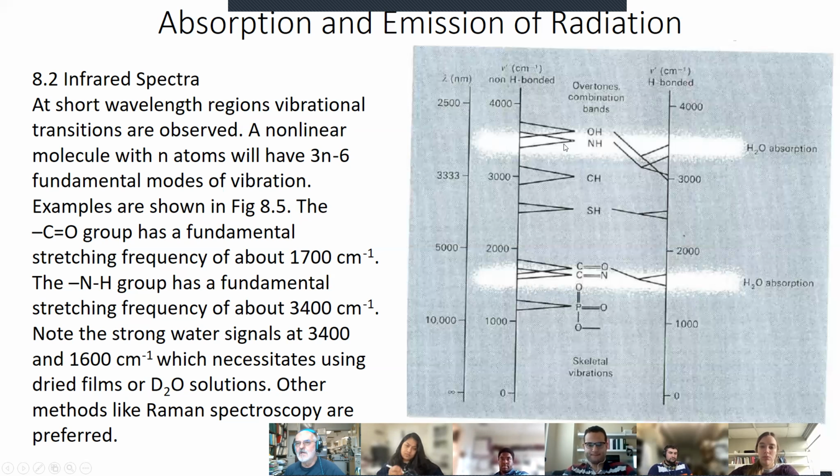If you've ever been in a lab that does infrared, often what they do is they make a powder and then they press the powder into a sheet, usually in some kind of a cell that then can be mounted in the spectrophotometer. And so what you've done is you've gotten rid of the water and you're taking an infrared spectra on a solid solution of whatever this molecule is. All right. And so it avoids the water problem.